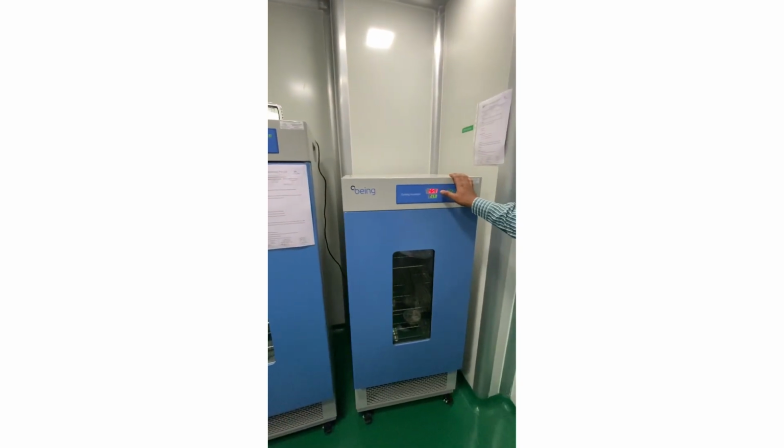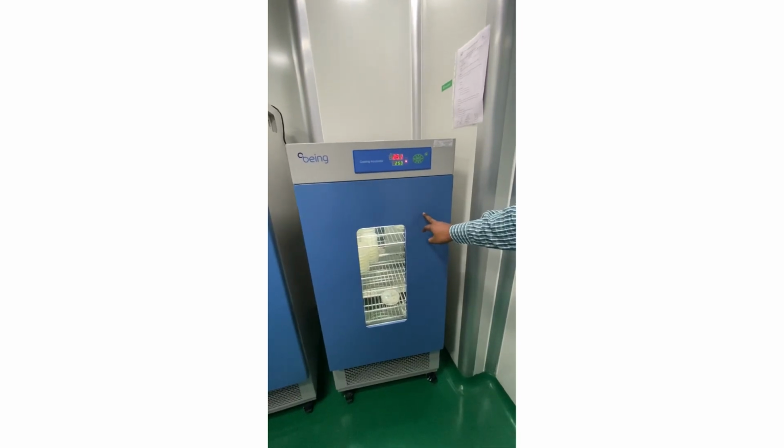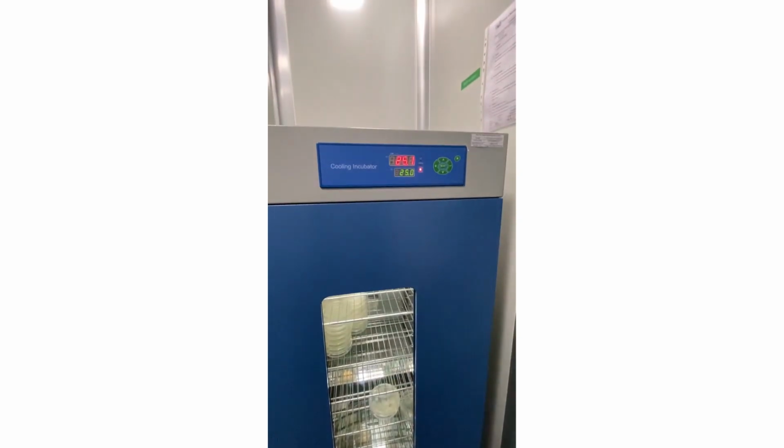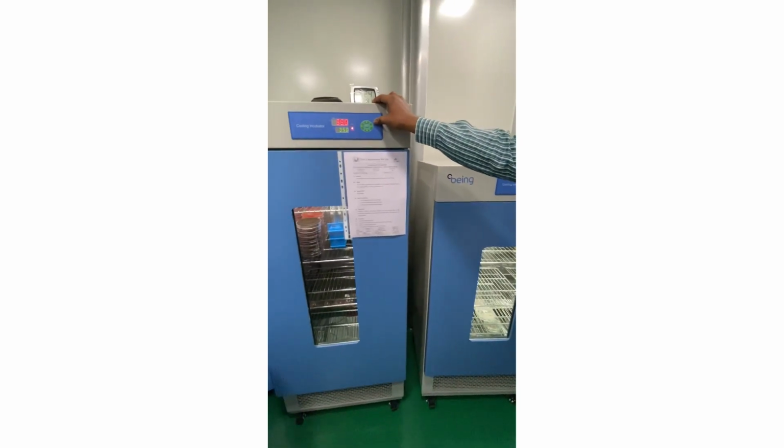This is for yeast and mold organisms. This is for 5 to 7 days. The temperature we are maintaining is 25 degrees. This is for iPulse, iCare, and also iCoffee black.